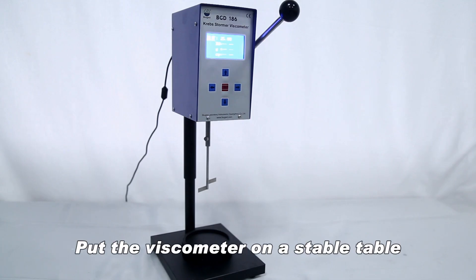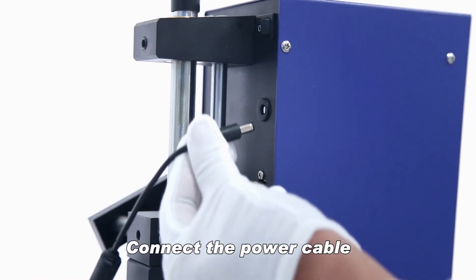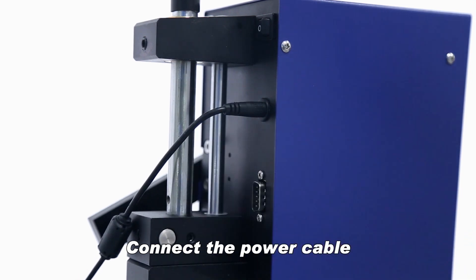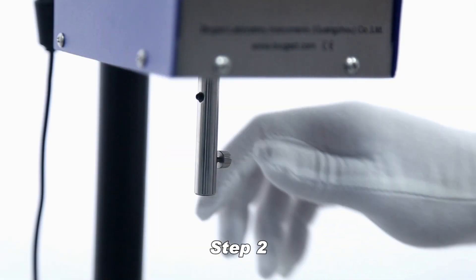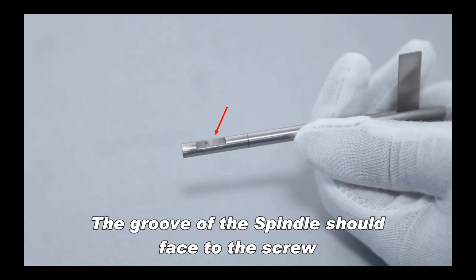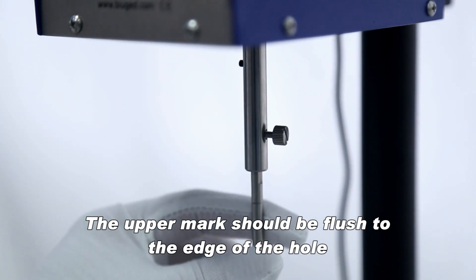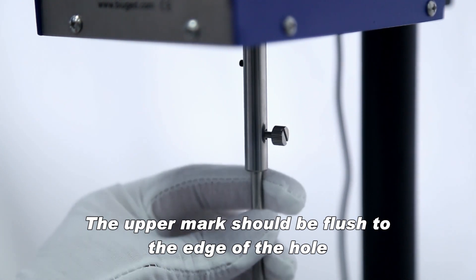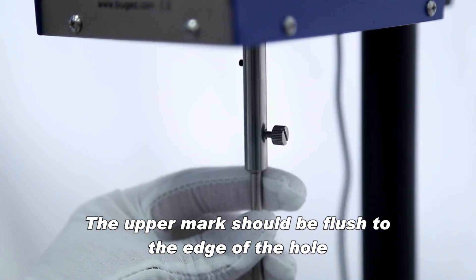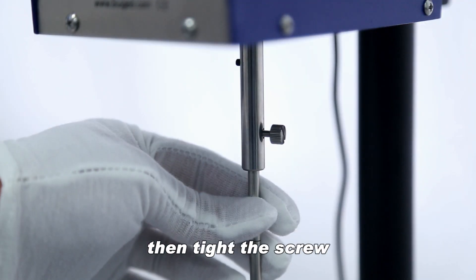Put the viscometer on a stable table and connect the power cable. Loosen the screw and install the spindle — the groove of the spindle should face the screw. The upper mark should be flushed to the edge of the hole. Then tighten the screw.